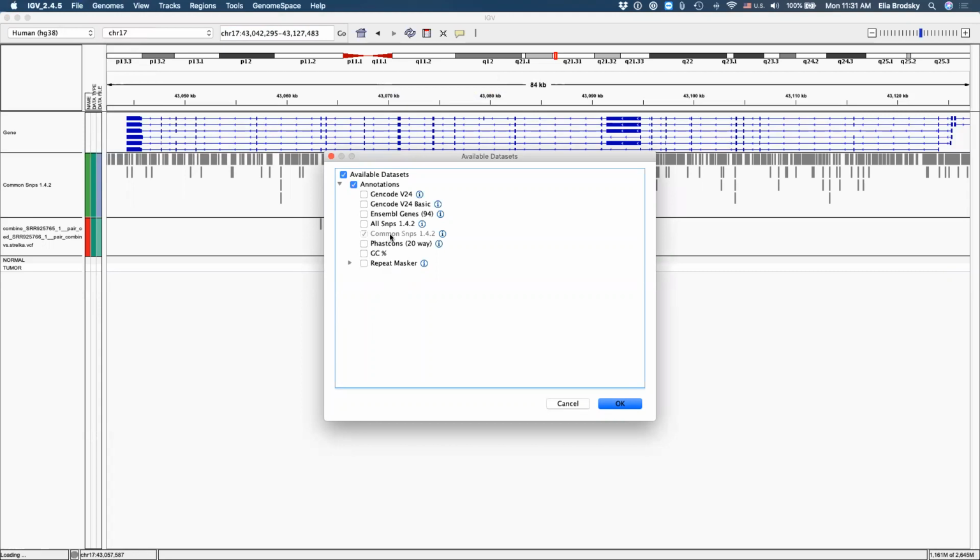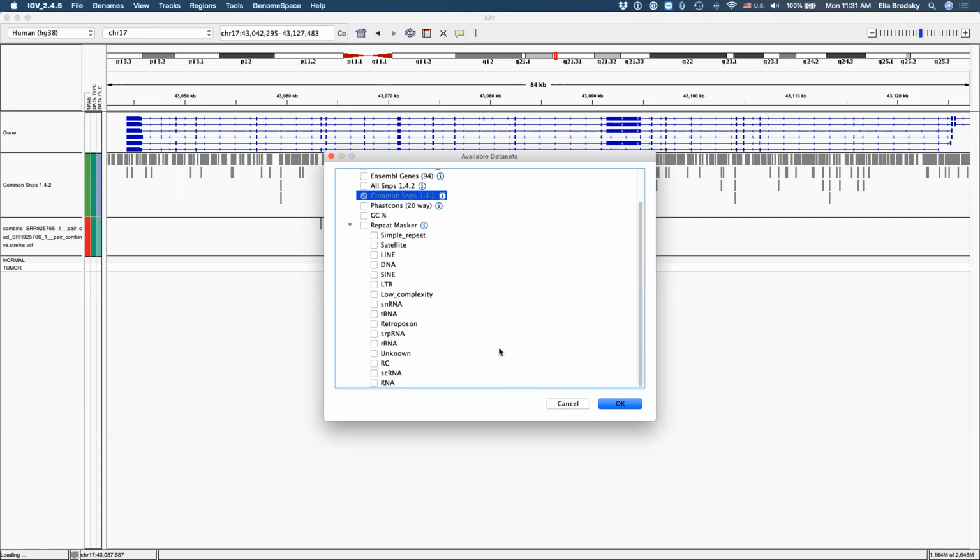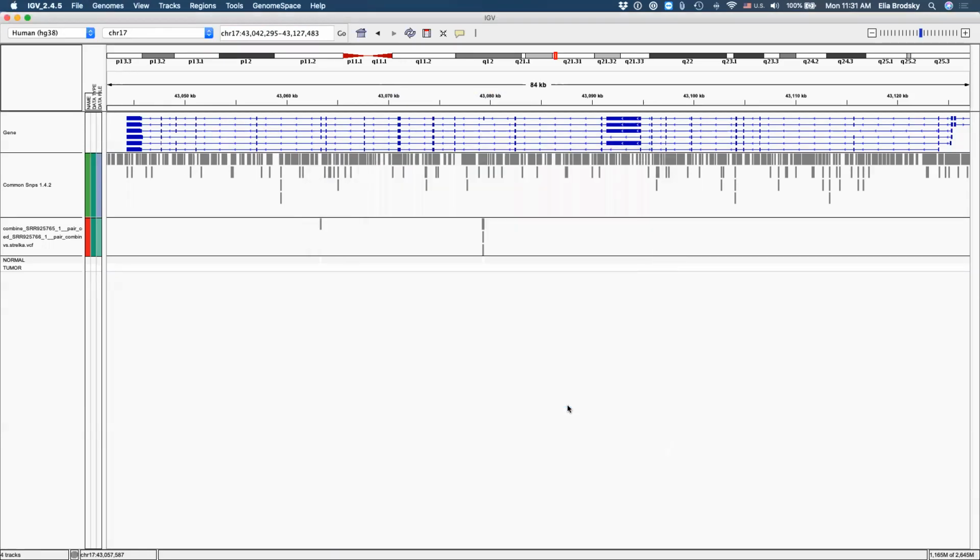We're just looking at common SNPs here. We have some other options here that we could look for. And you can also load some of your own, or for example, external reference cases, which we will go through in later sessions when we talk about annotation. But the first illustration that we wanted to do here is that you can look at the raw data, where a lot of questions come in. How many reads is enough to detect with confidence a single nucleotide variant? What are the different positions that we're looking for, which genes, right?